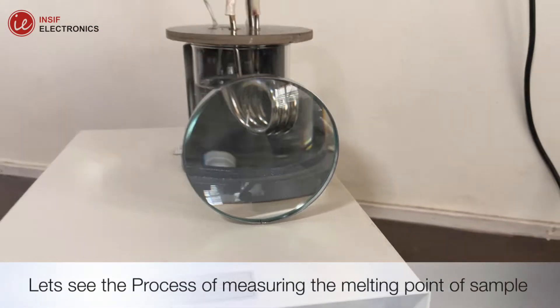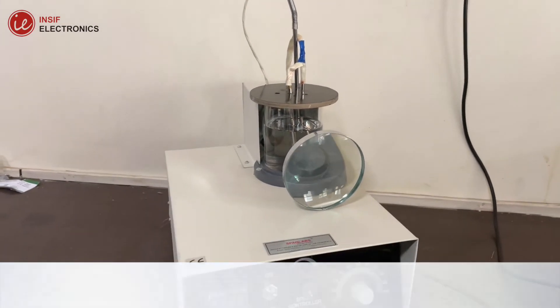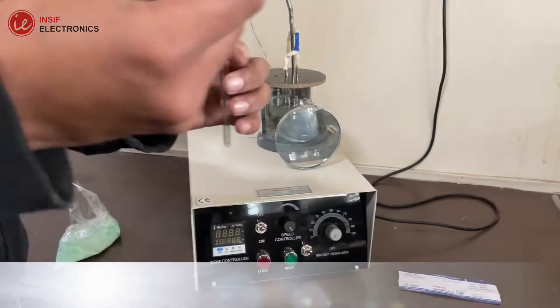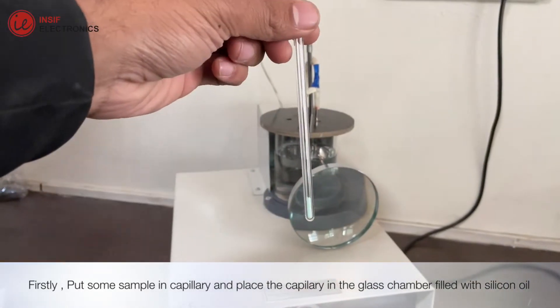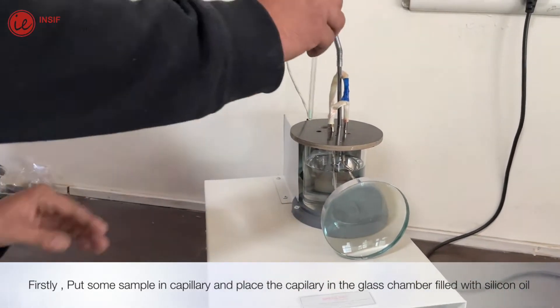Let's see the process of measuring the melting point of a sample. Firstly, put some sample into a capillary and place it in the glass chamber filled with silicon oil.